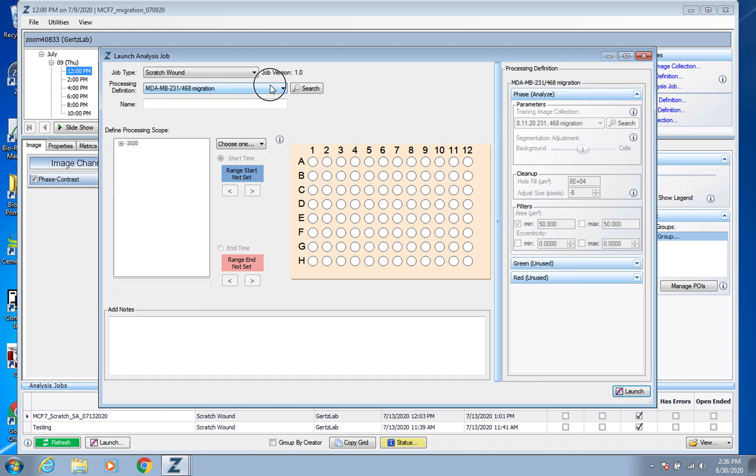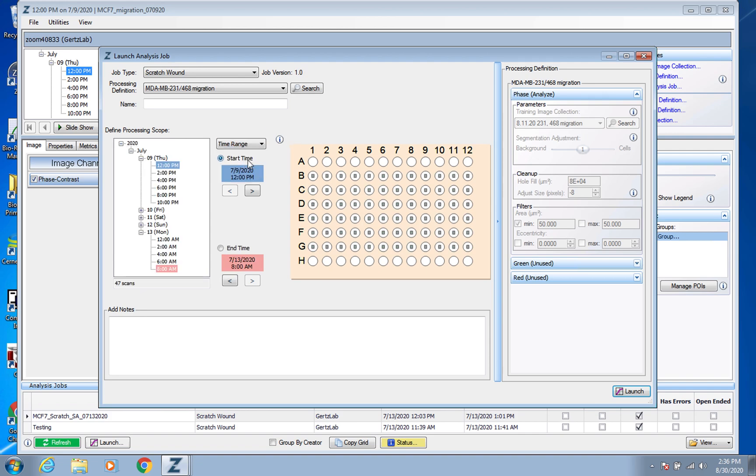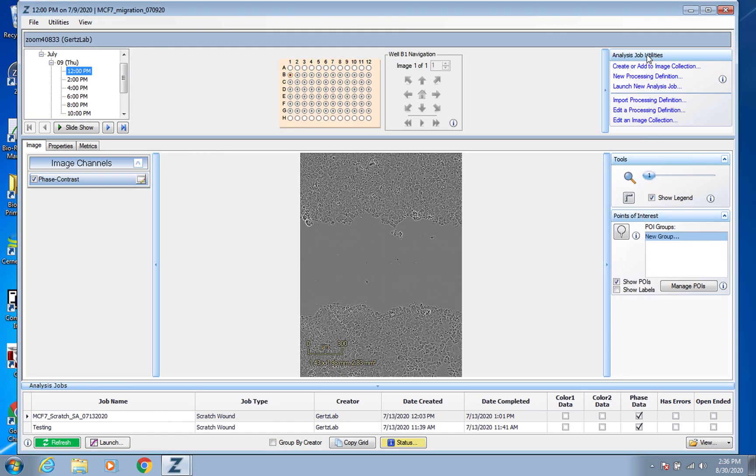And now it's automatically giving you Scratch Wound processing definitions and you can find all the ones available here. And then again choose a time range, highlight everybody that you want, name it something that makes sense and press Launch. And it's going to take probably a couple hours, two to three hours estimate.